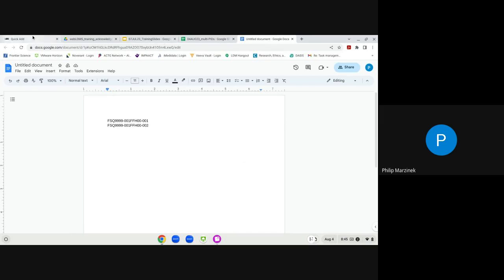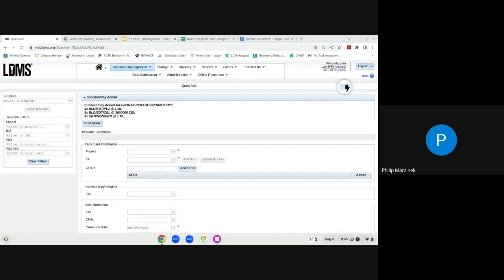Once labels are printed, verify they printed successfully by scanning them with the barcode scanner. Open a Google document or Notepad, click in it, and scan a label. The global specimen ID will populate — you may see an FSQ prefix in front of the global specimen ID when scanning outside the LDMS platform. This is normal. Test a few labels to confirm the global specimen ID from the scan matches the ID on the label.